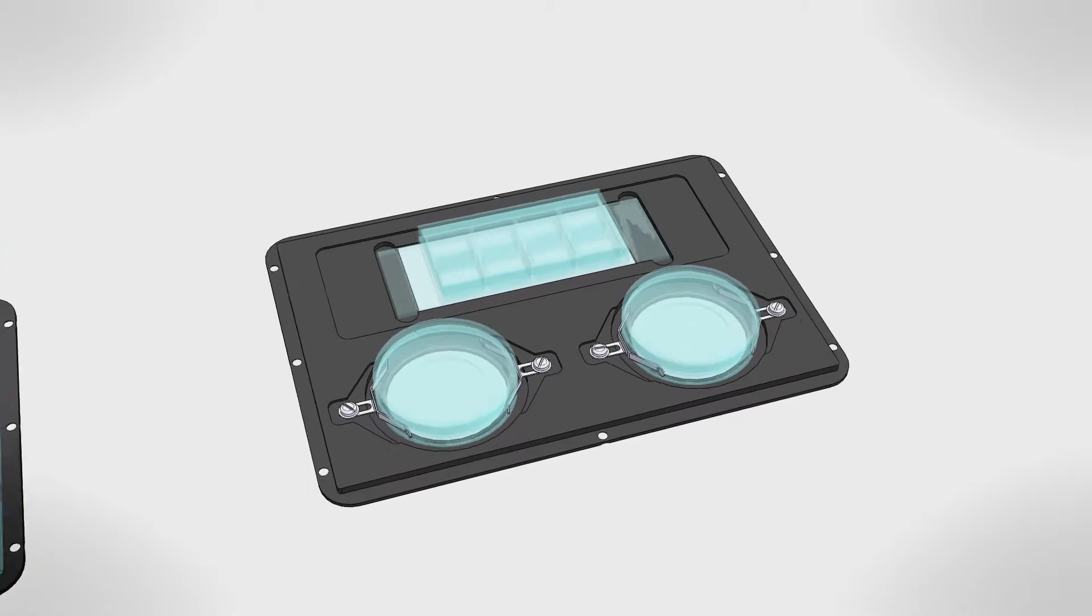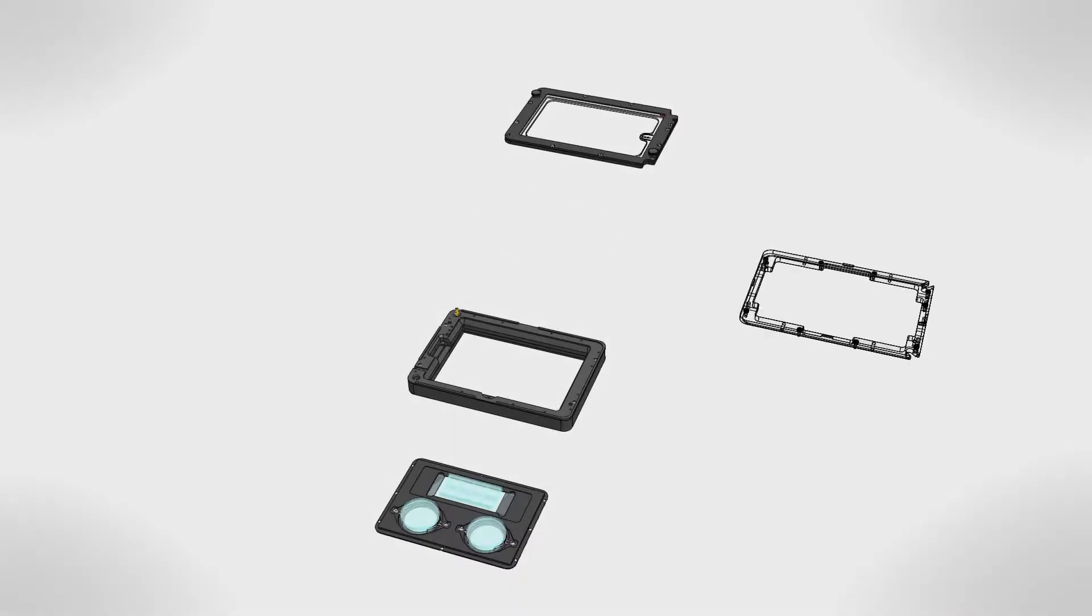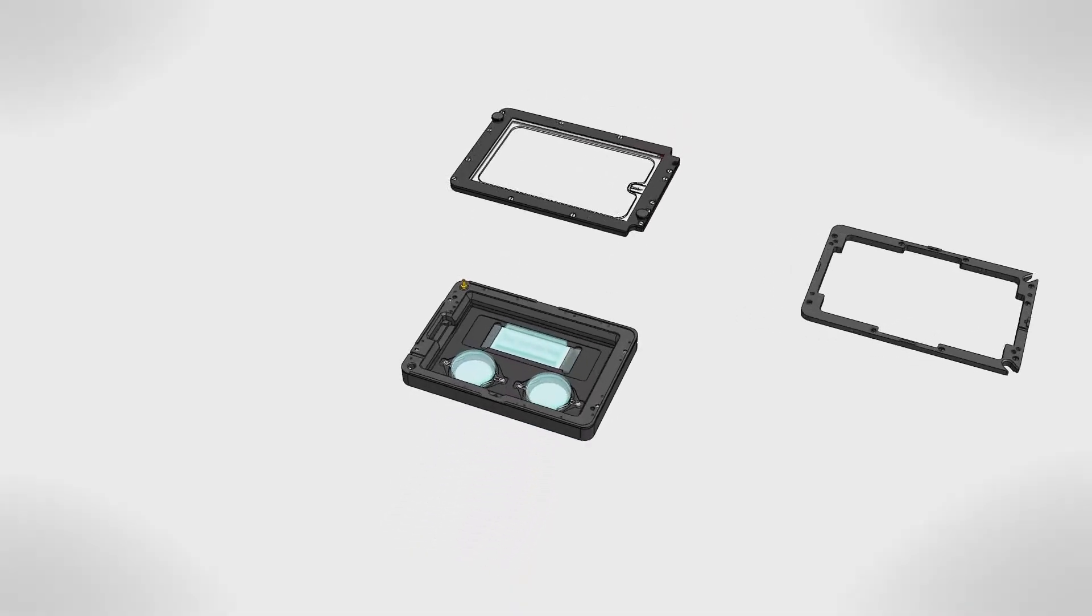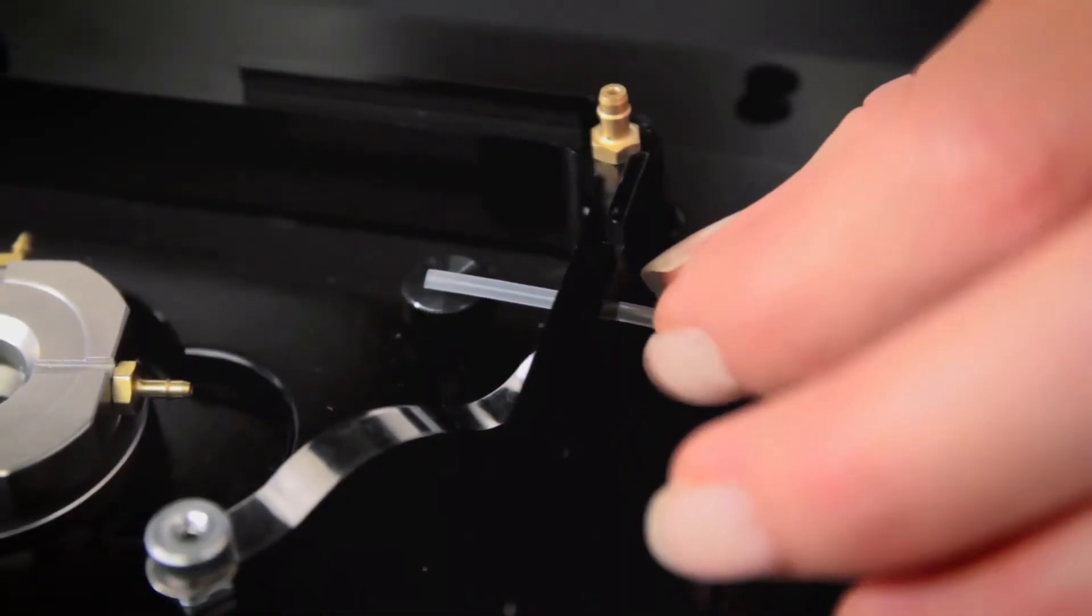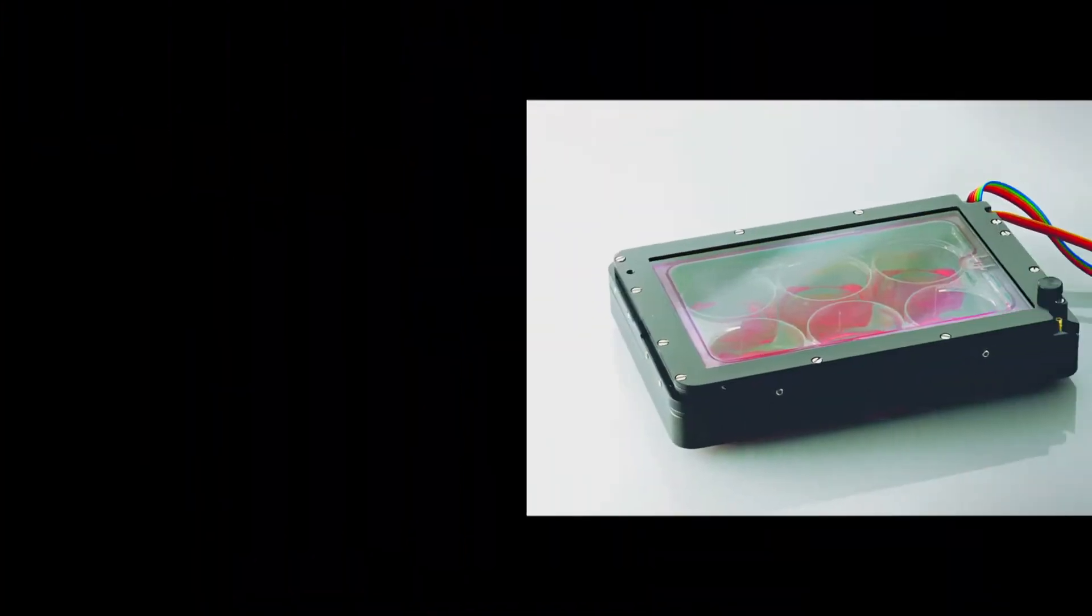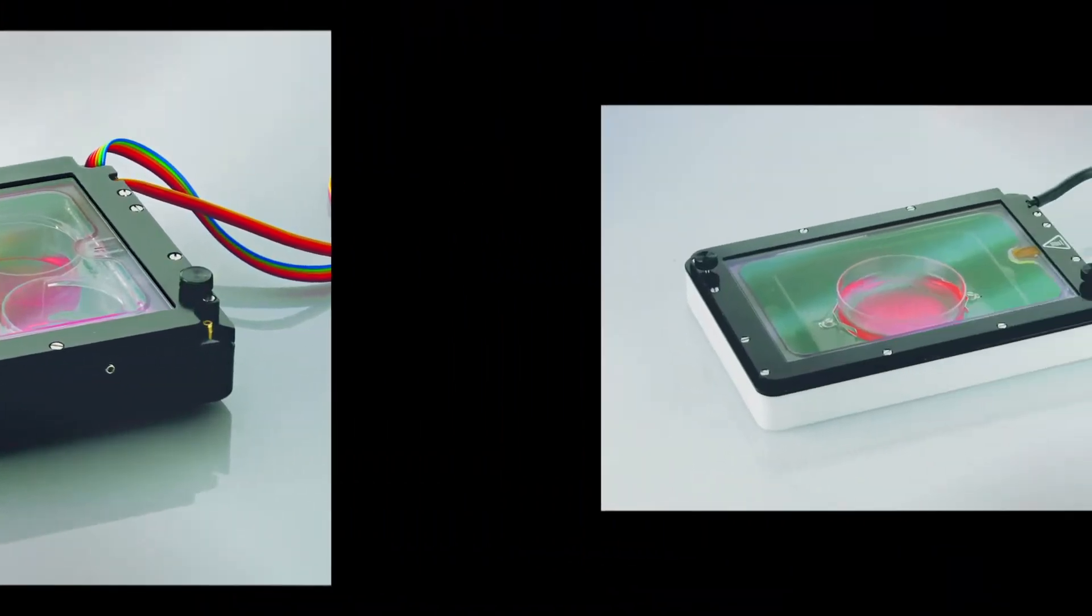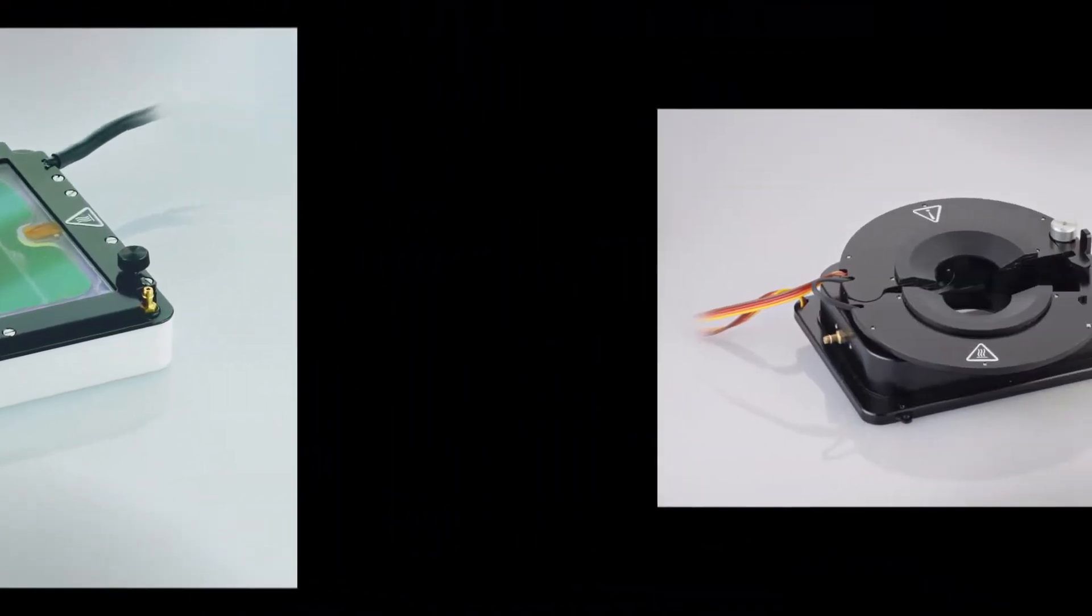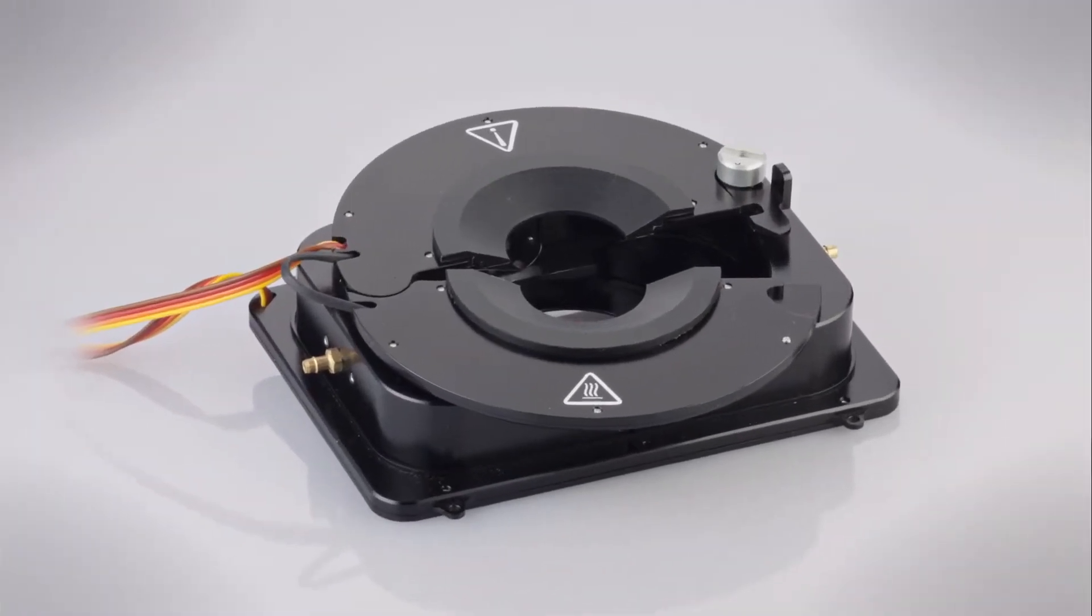Petri and slides do not require the chamber riser. Small holes on the sides of the chamber allow to introduce perfusion tubings. Several models of chambers are available to fit any XY stage on inverted and upright microscopes.